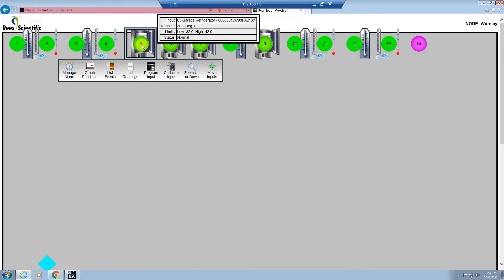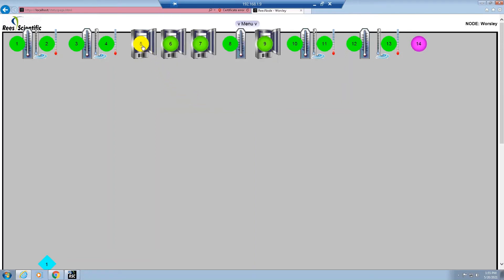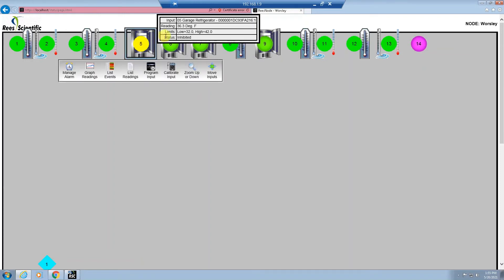When you click on an icon, you will get the status of the input along with the menu that comes up. If an input is in alarm, you will click on manage alarm and a dialog window will appear. The default setting to inhibit an alarm is for 15 minutes. If you want to choose a different amount of time, you will select the middle radio button and can manually enter the time needed from 0.01 hours up to 9,999 hours. To inhibit an input for 30 minutes, you would use 0.5 hours. You will enter your username and password and hit the go button, and you will see the input turn into that yellow condition showing a status of inhibited.